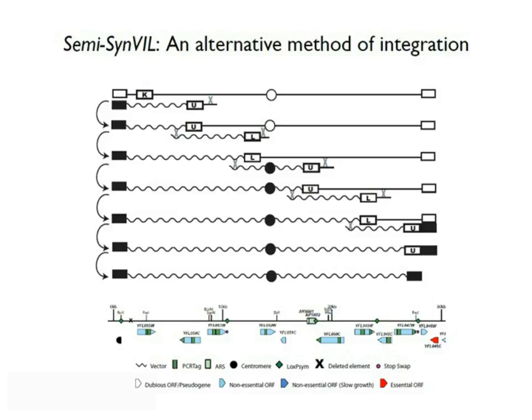So we can closely monitor what happens to the cell when you replace the wild-type DNA with synthetic DNA. If at some point the cell becomes really sick, or you don't get any cells, then we will know it's very likely due to the last 30,000 base pair we just transformed into the cell. And then we can go in and try to debug from that 30,000 base pair.